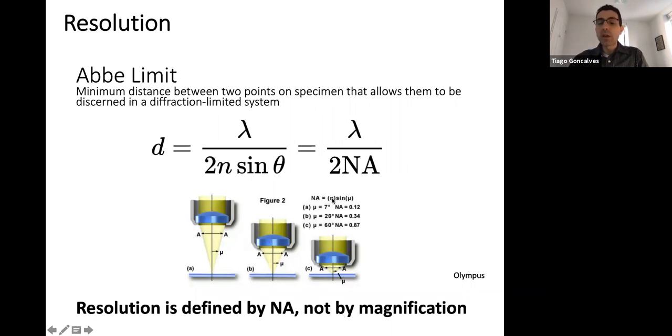And it's dependent on the refractive index of the glass, which will be matched to your medium, usually water for in vivo two-photon microscopy, which is approximately 1.33.